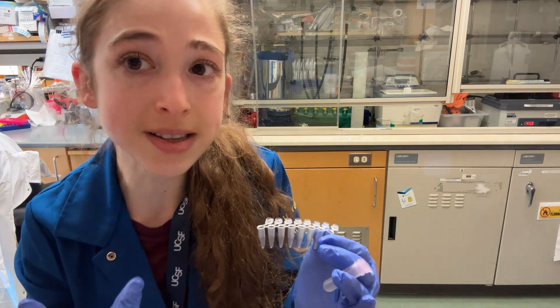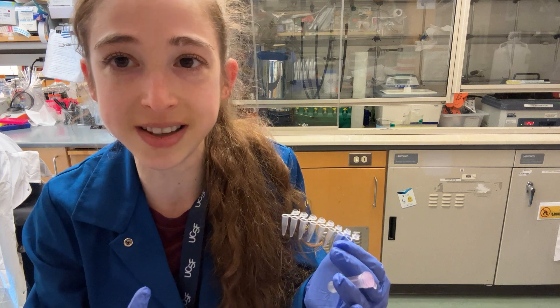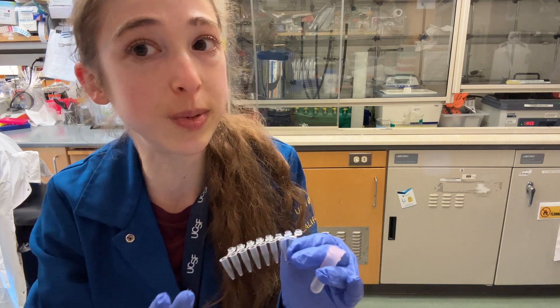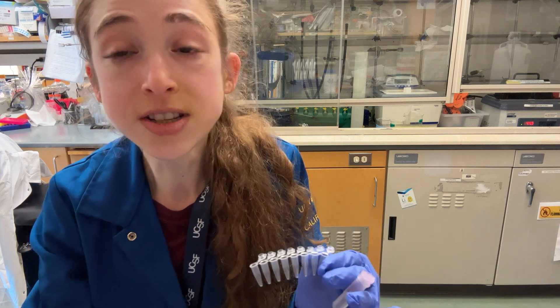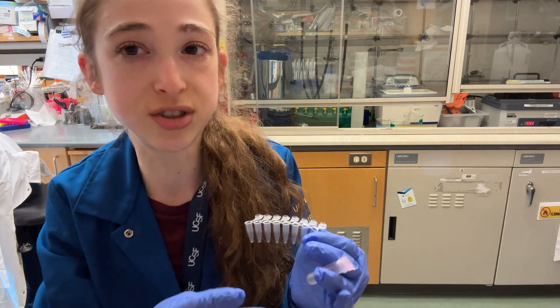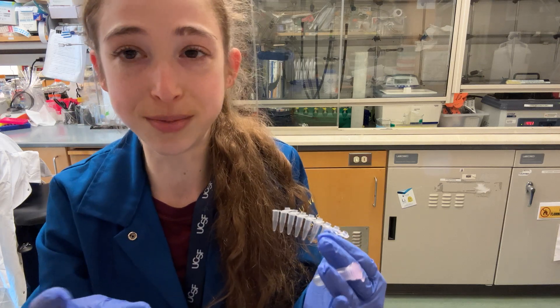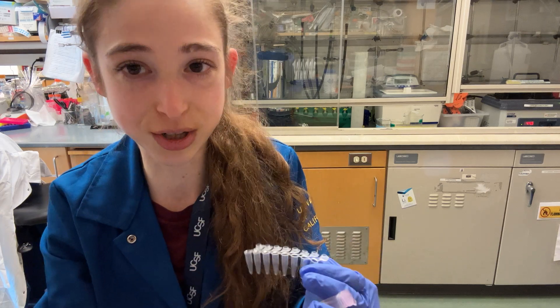If you need more of a PCR product, it might be tempting to just increase the volume — say, double it from 50 to 100 microliters. But really, you're better off splitting it up into multiple tubes. Go ahead and make that 100 microliter worth of reaction, but split it into two tubes. Even better, make four reactions worth and put it into four tubes.